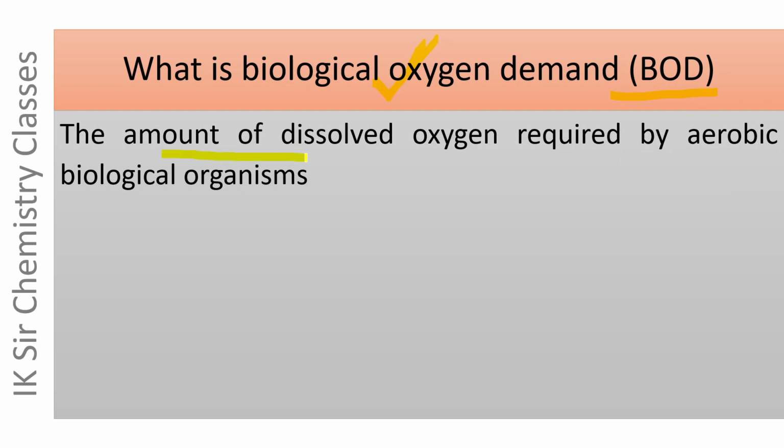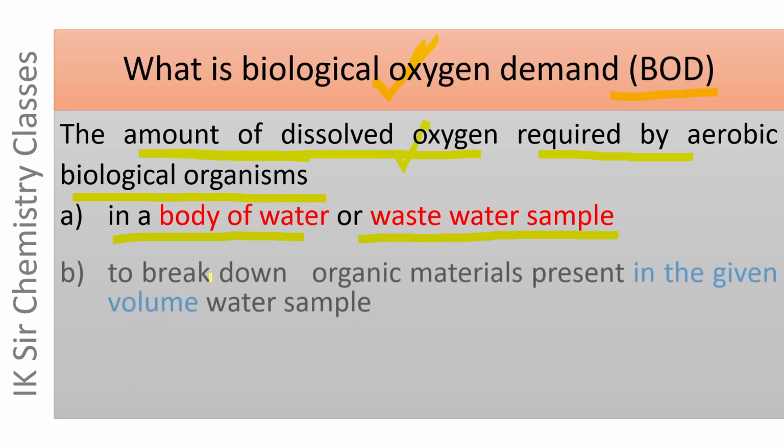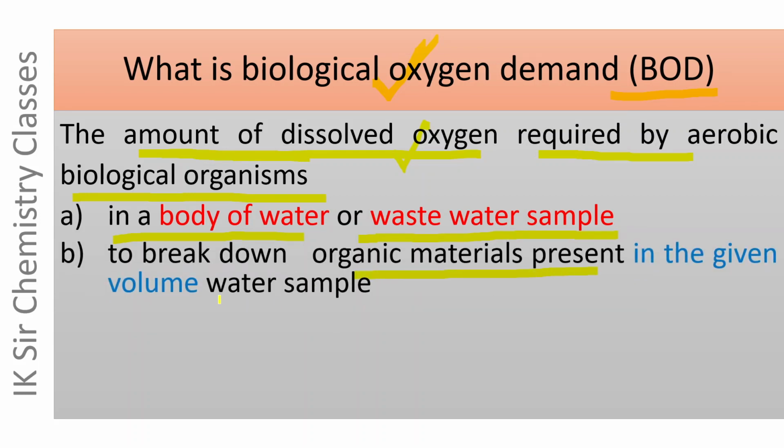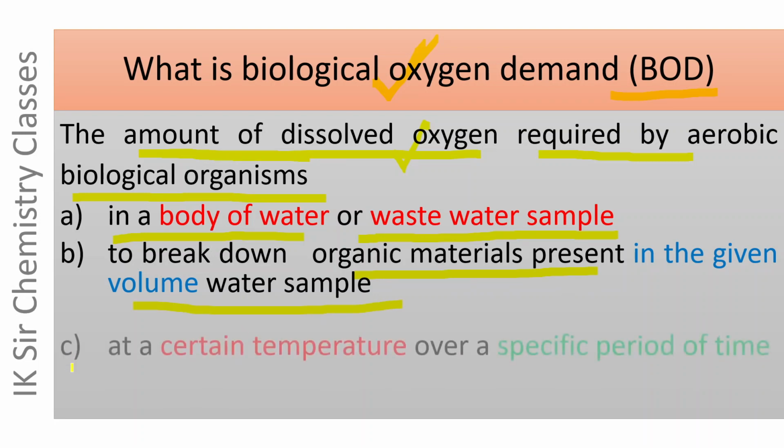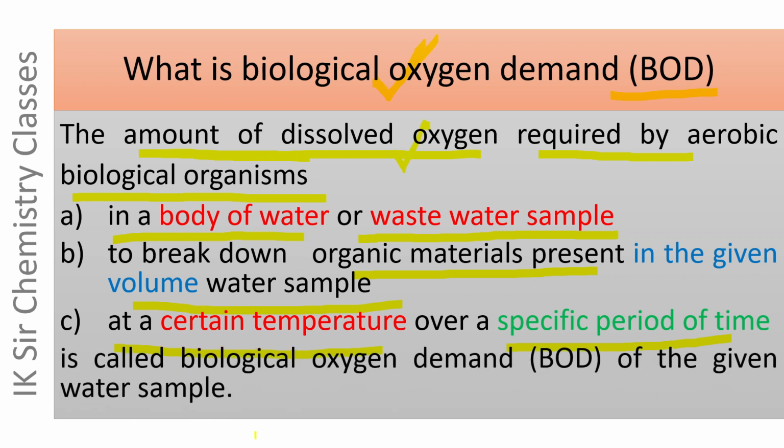The amount of dissolved oxygen required by aerobic biological organisms such as aerobic bacteria in a body of water or wastewater sample to break down organic materials present in the given volume of water sample at a certain temperature over a specified period of time is called biological oxygen demand of the given water sample.